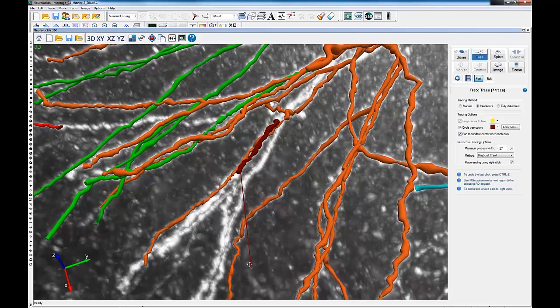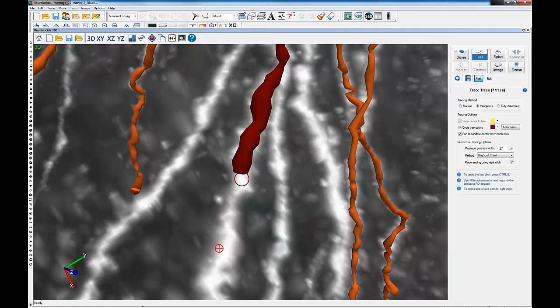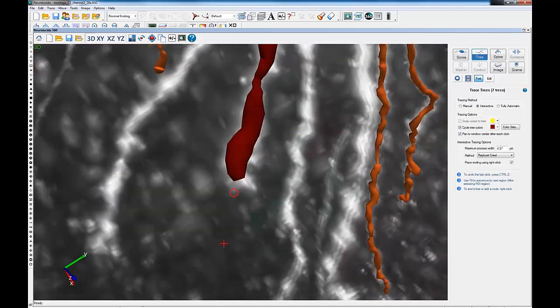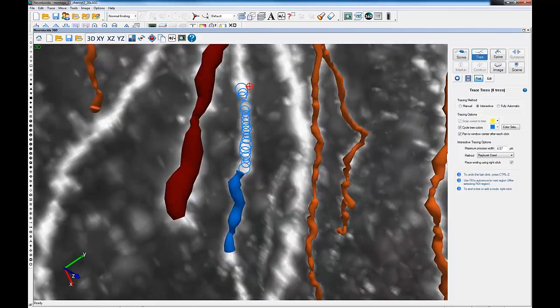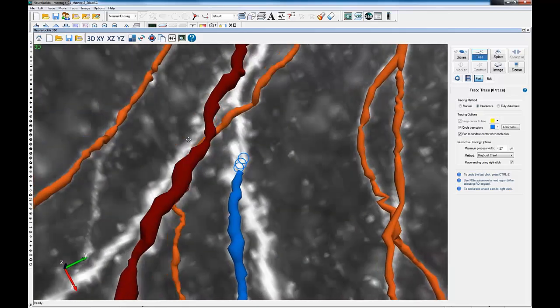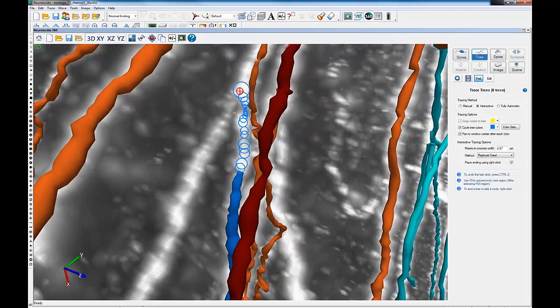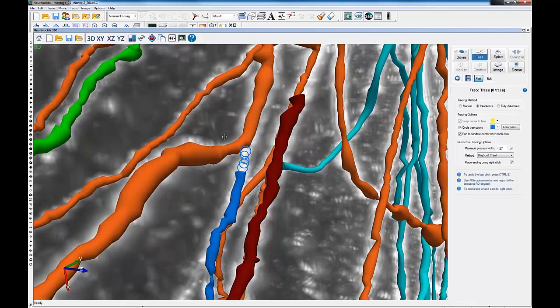For the question of the streptavidin, our collaborators, when we did all this cell filling and recording, used the streptavidin Alexa 546 from Vector Labs at a 1 in 500 dilution. That's what they've been using for all of these experiments. And again, they also get their biocytin from Sigma. So anything that's pretty standard, the usual. Yeah, pretty standard.